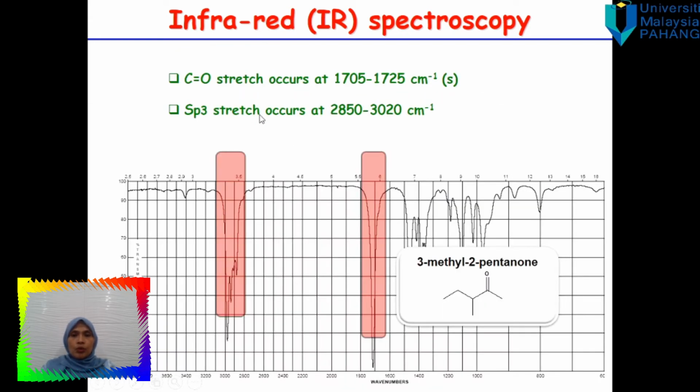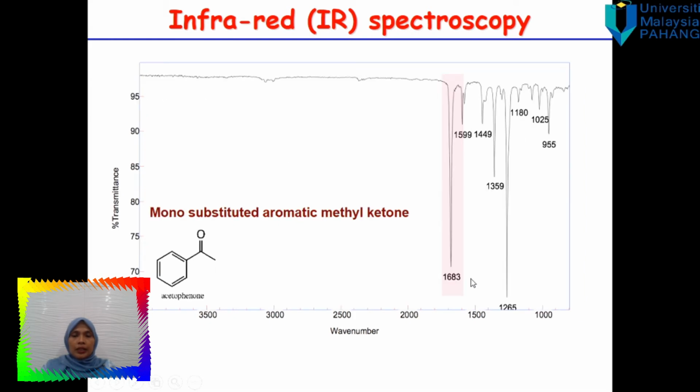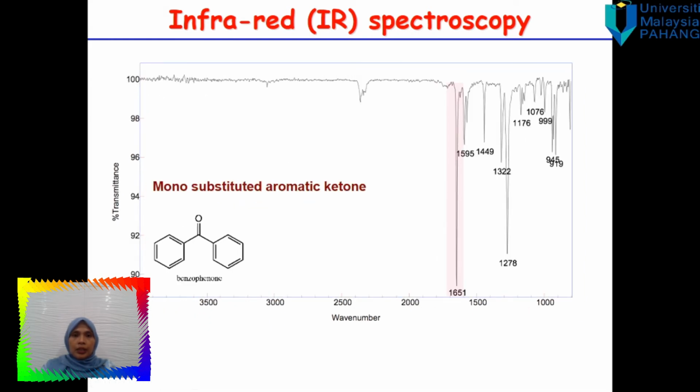And C=O for the ketone, same, C-H sp3 and C=O, and again the ketone.